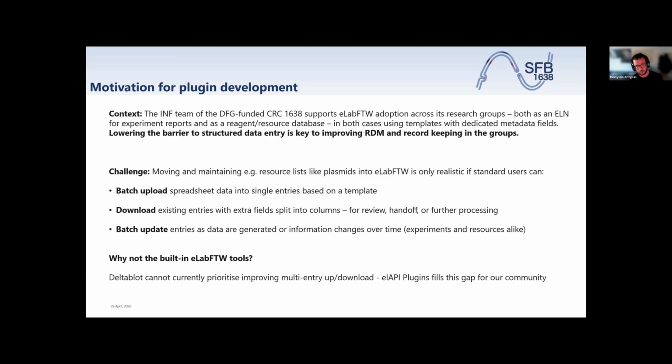So it's not only a tool for admins, either eLabFTW or our eLapi plugins. The goal is that everybody can use it and manage to maintain and move the resources and experiments. What we do is make the batch upload and batch download of your research data easier.